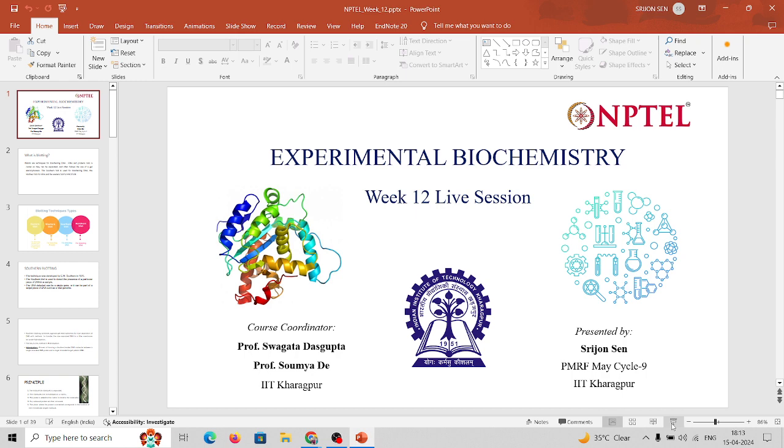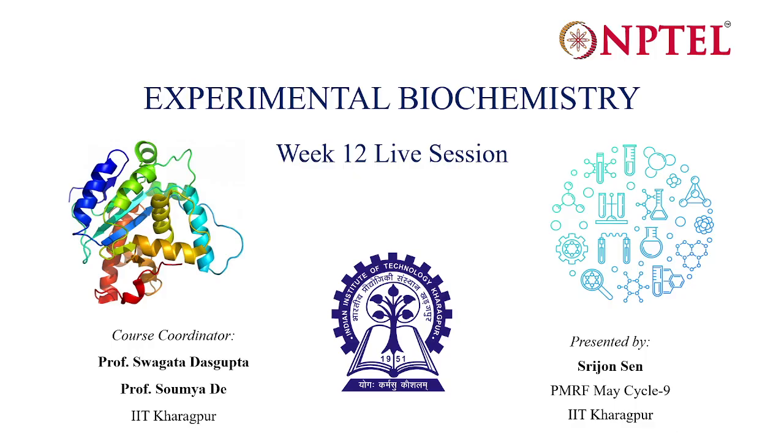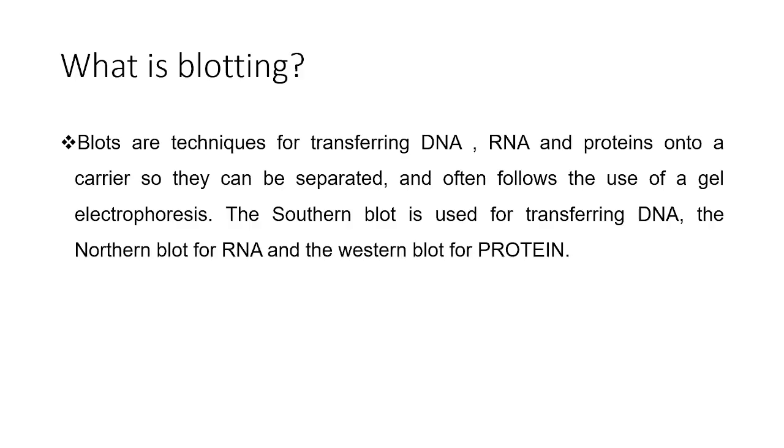Great. So in today's lecture, we would be mostly discussing blotting, where we'd be discussing the major types of blotting techniques, broadly classifying them under immunoassay techniques. So mostly today's class will deal with blotting and the different applications of the different blotting techniques. So we would be talking about that.